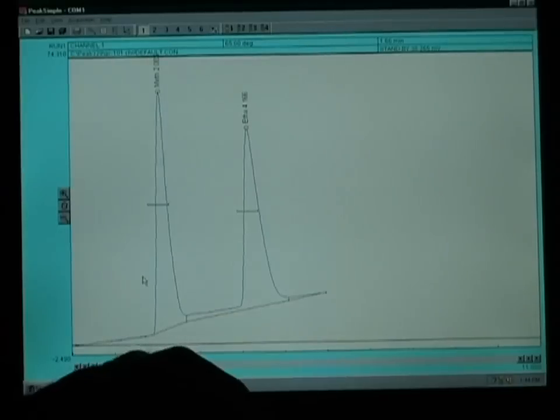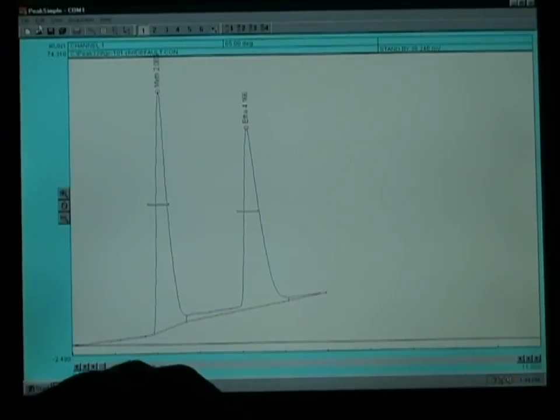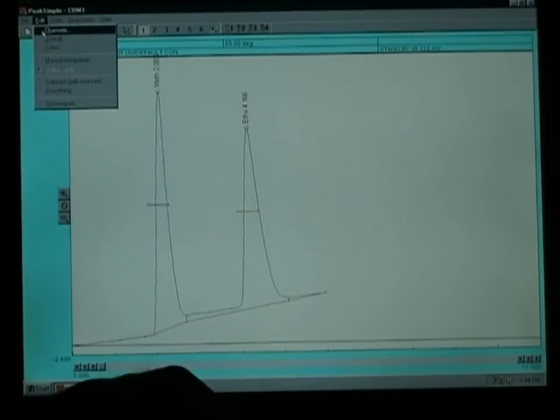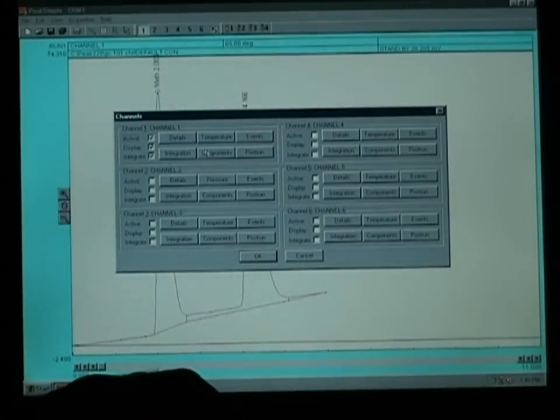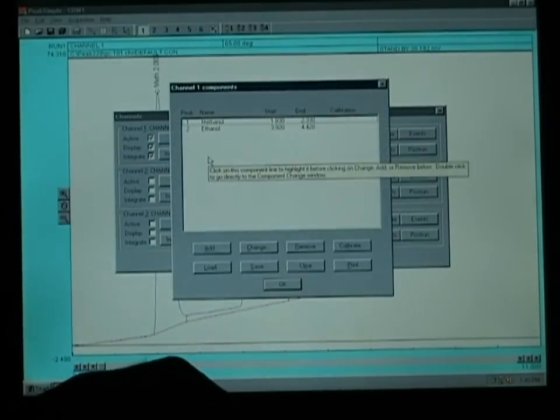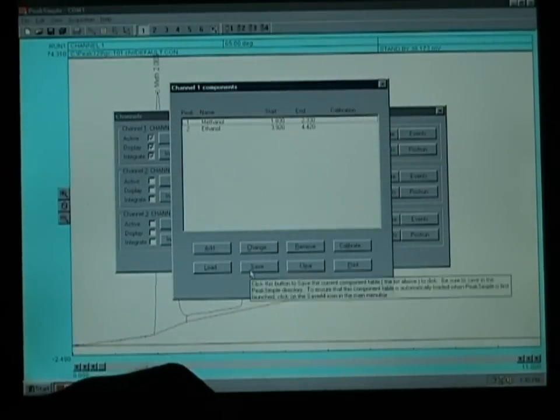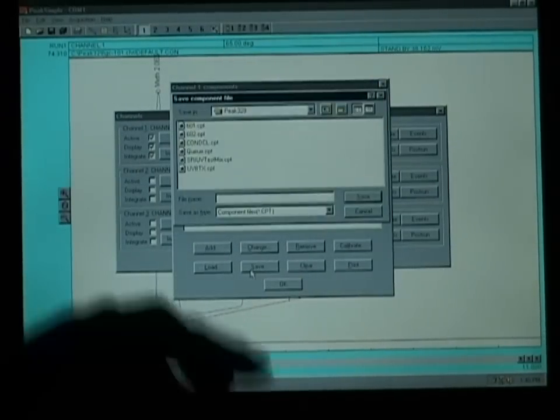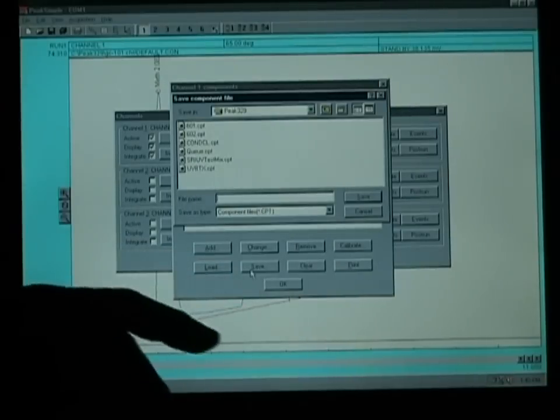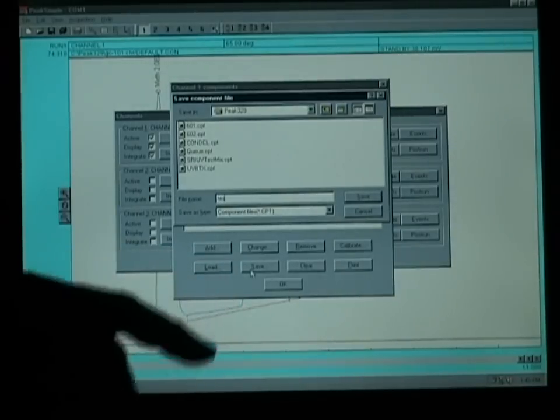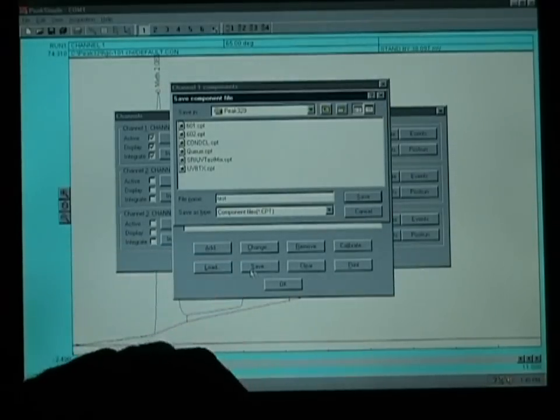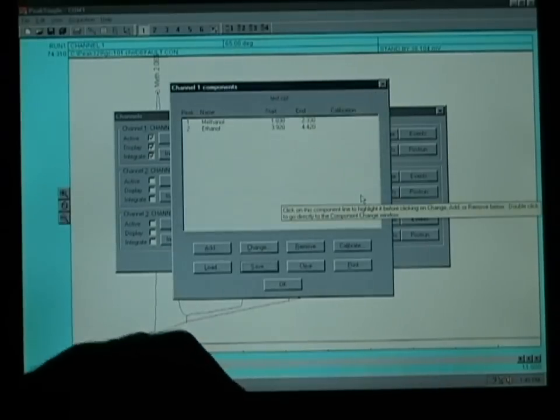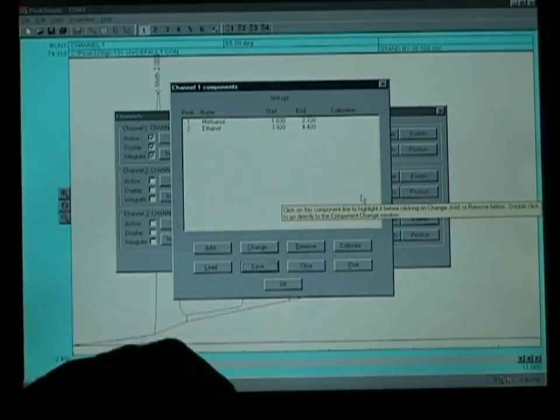If you would like to save the components that you've just identified, click on Edit, Channels and under Channel 1 Components and save that component file under a specific name that can be retrieved later with these retention time windows.